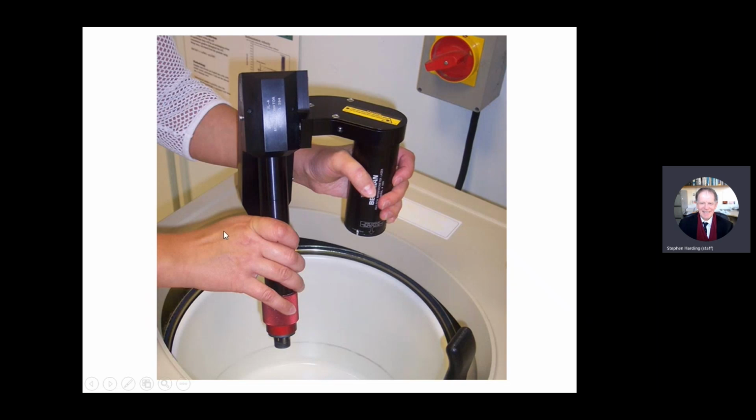This is the monochromator. So you put your rotor in the ultracentrifuge, and then you put on this monochromator here, which is used for the UV absorption optical system, which is tuned, if it's proteins, usually to 280, because that's where the aromatics absorb, tryptophans, tyrosines, and things. Yeah, we did that last week with the spectrophotometers and things.